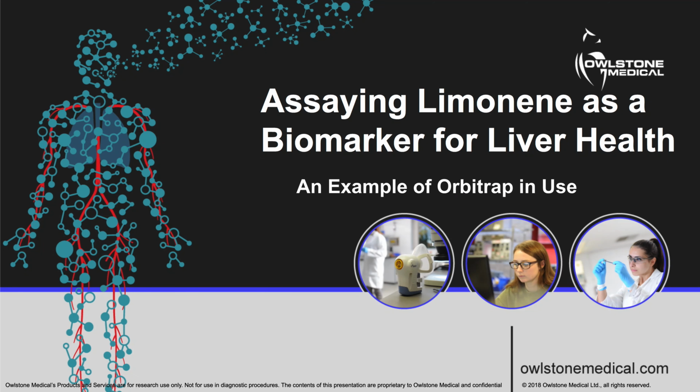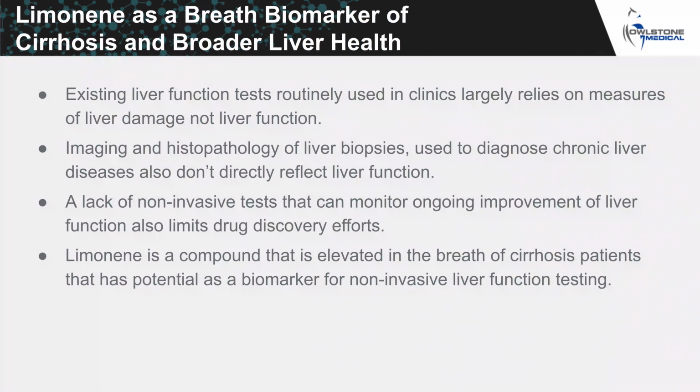So for the last segment of this talk, I'd like to describe the assay for limonene using breath biopsy. As I mentioned earlier, one of the things we are keen on as a company is developing tests. So what follows is an overview of a concept and some early stage experiments for analyzing limonene from breath. One of the things I hope to achieve here is to give you a flavor of wider applications outside of untargeted biomarker discovery using breath biopsy.